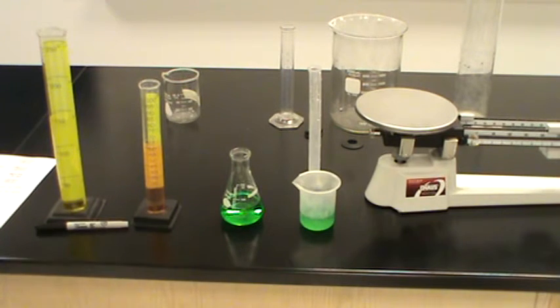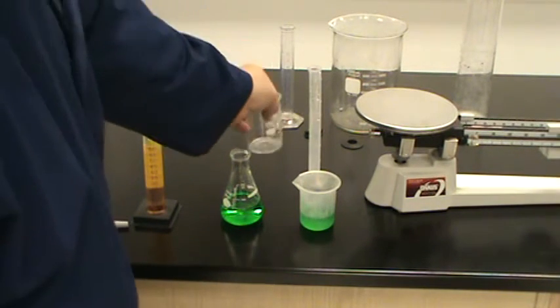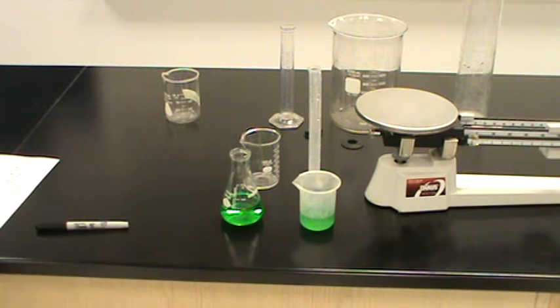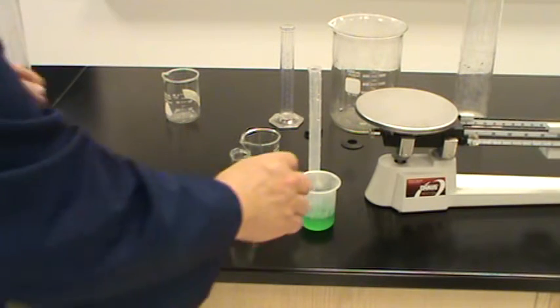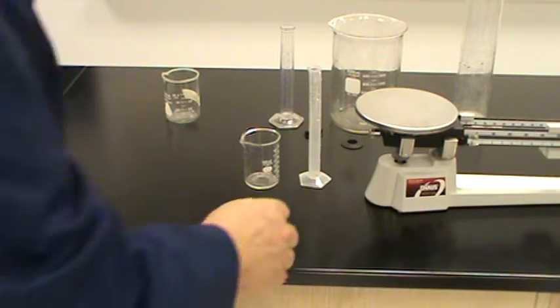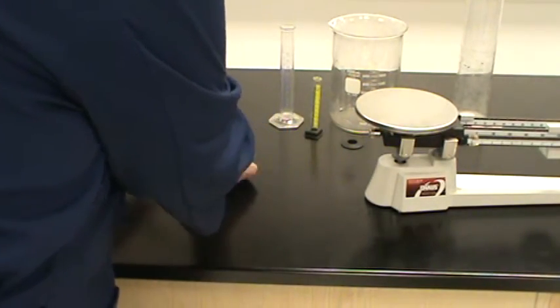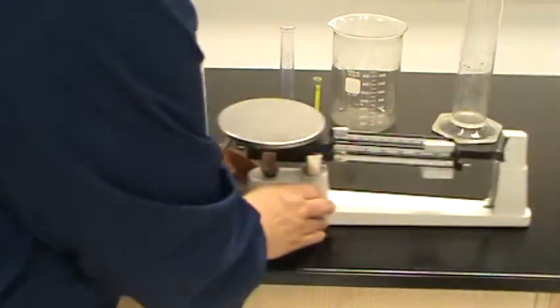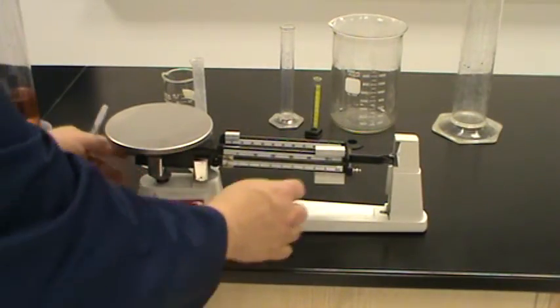And then finally, I asked you to do the following operation. If you'll recall, one of the first videos that was posted at our Dexter Middle School channel was where I proved 1 milliliter of water weighed exactly 1 gram. Well, we're going to do it again, but we're going to do it a different way. We're going to take our triple beam balance that we just used in a previous video.